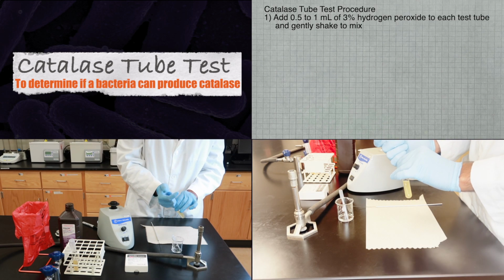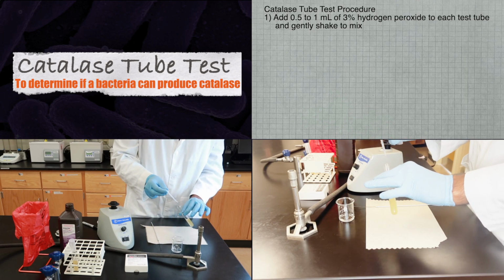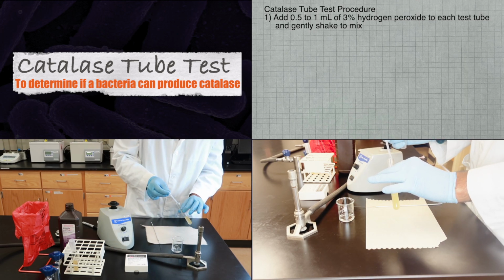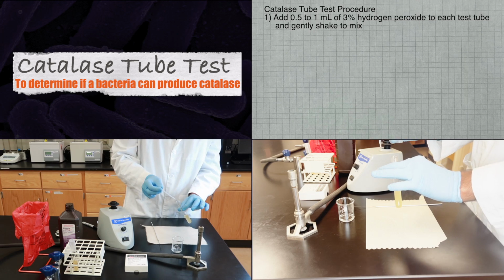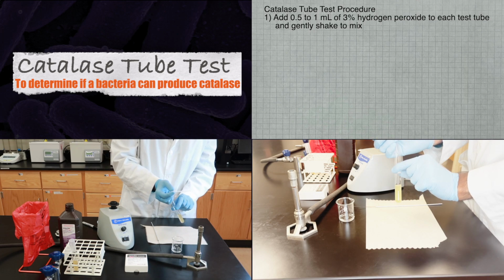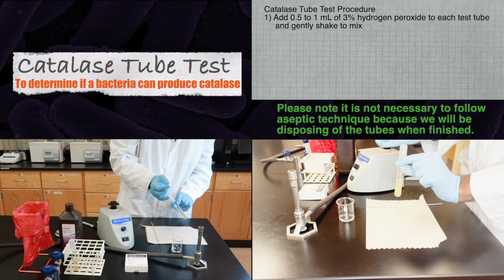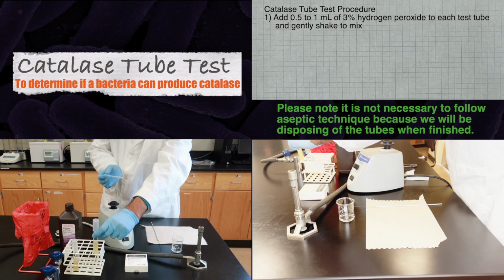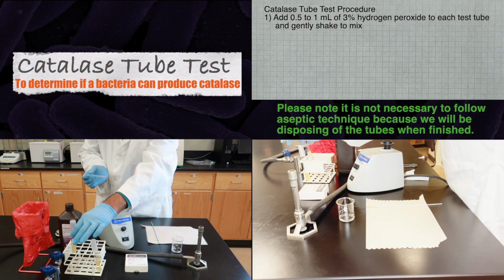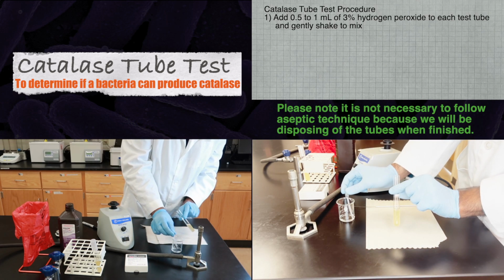An alternative to the Catalase Slide Test is the Catalase Tube Test. For the Catalase Tube Test, please add 0.5 to 1 milliliter of 3% hydrogen peroxide to each test tube and gently shake to mix. Please note that for the tube test, it is not necessary to follow proper aseptic technique because we will be disposing of the tubes when we are finished.